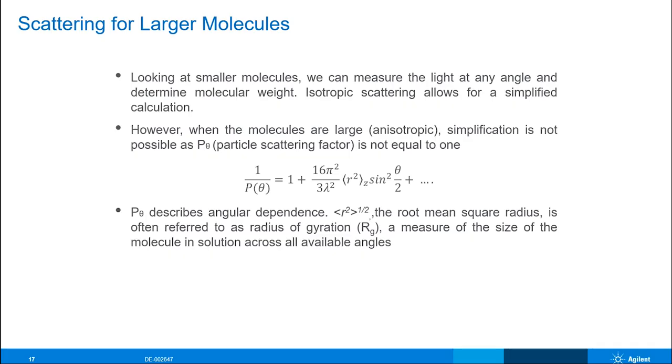Now, as these molecules get larger in solution, and we start leaving that 10 nanometer space behind and move towards 20, 30, 50, 100 nanometers, then radius of gyration is something that we'll be able to calculate with more and more precision.